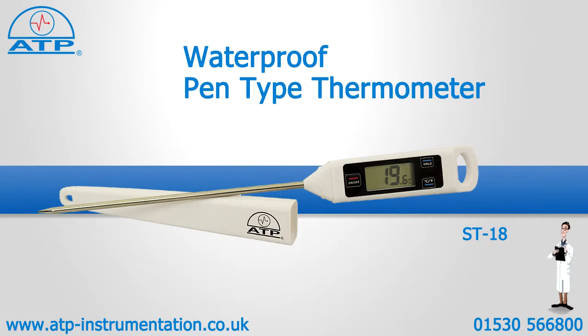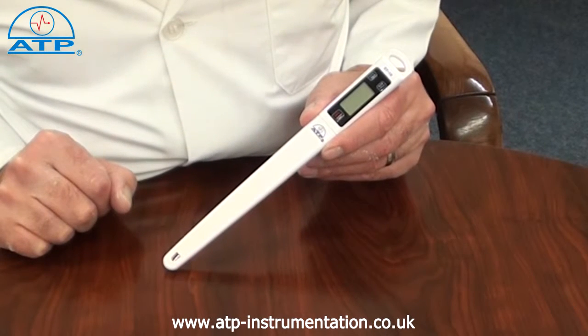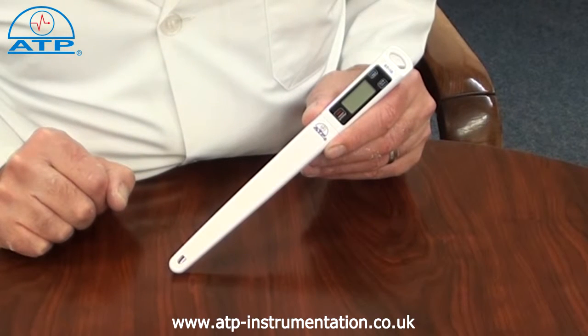An introduction to the waterproof pentite thermometer. It is supplied with a probe-protector sheath and button cell battery. This instrument is ideal for temperature monitoring of liquids and semi-solid items such as food.